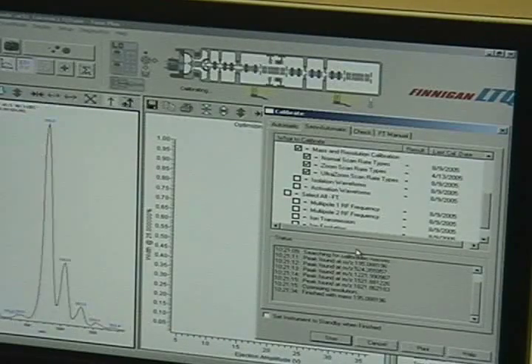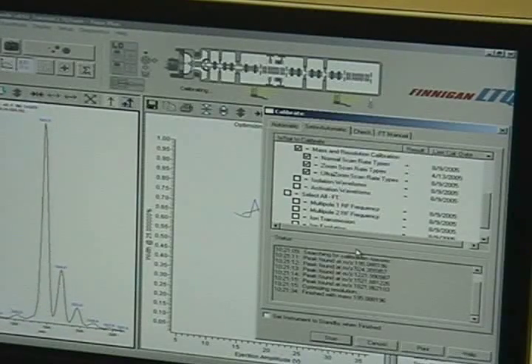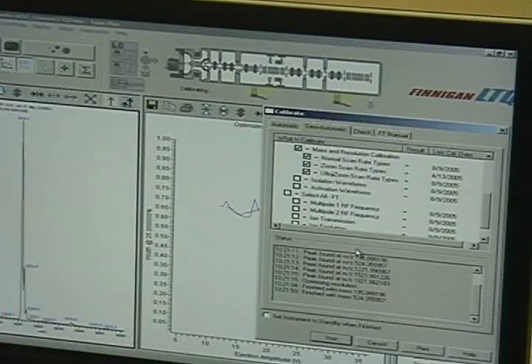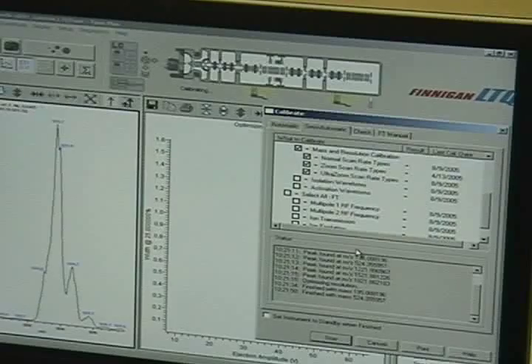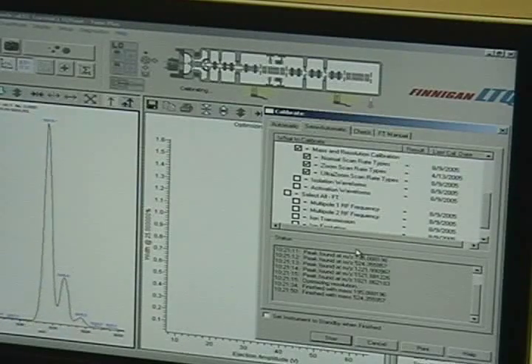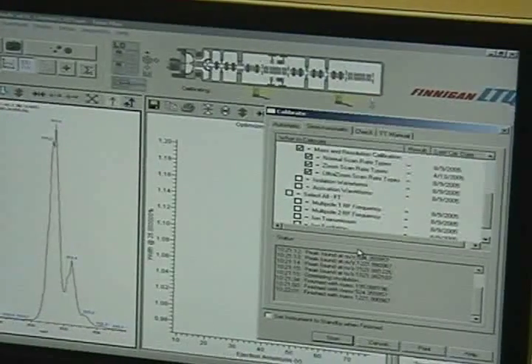I can actually draw you the full MS2 of angiotensin and label all the peaks properly, with the abundances I typically see on a trap, yes. The 784, the 1028, the 630, I got them all down. Scott Vaccaro in San Diego used to be able to just look at the tandem masses that come out and say which phosphopeptides they were. That's loserville. You'd be like, CD3 receptor, bam, bam.